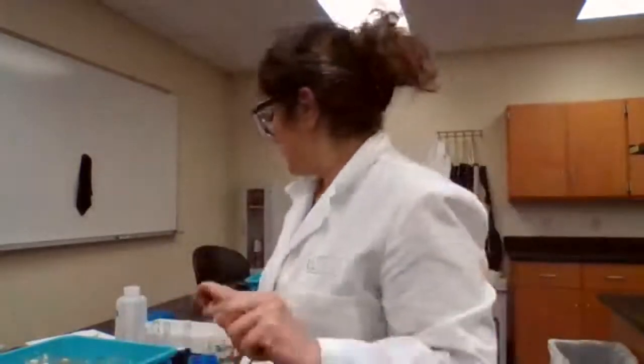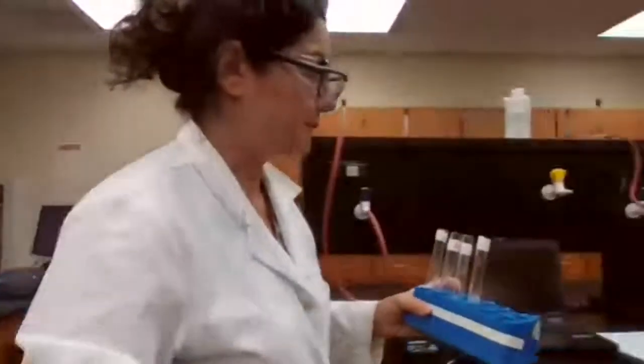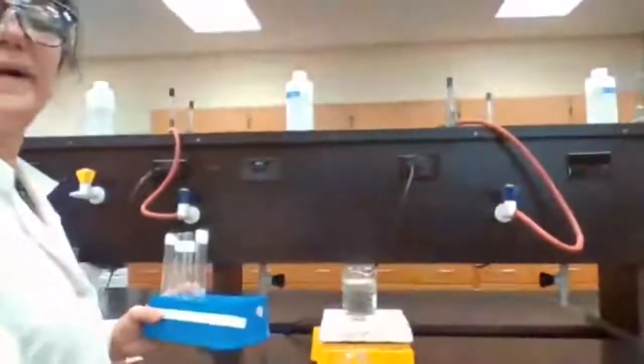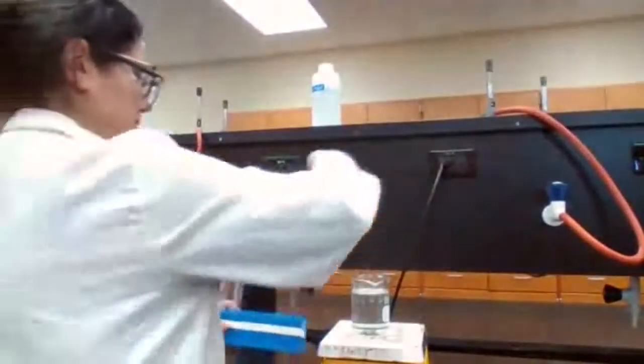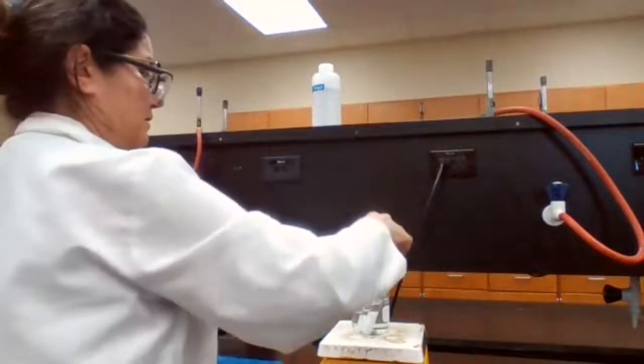Fill the beaker. Place the test tubes in the water bath. Come here, I have the water bath already prepared. I'm going to leave these test tubes inside.